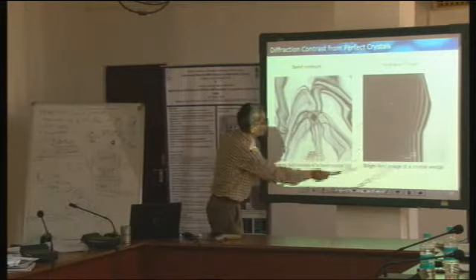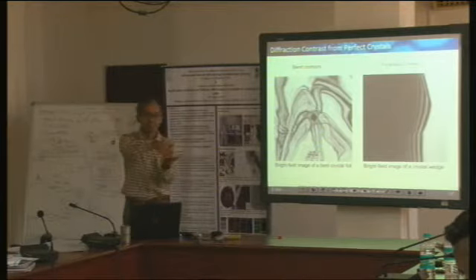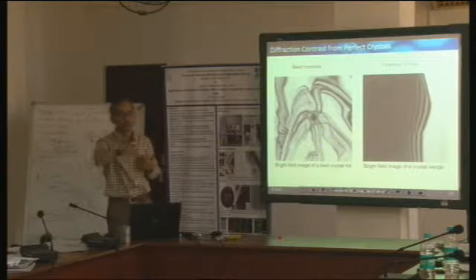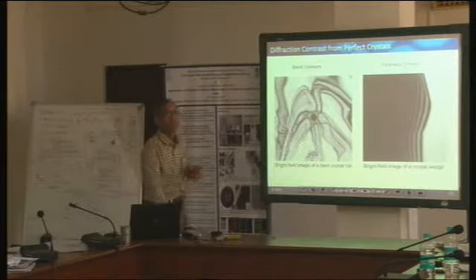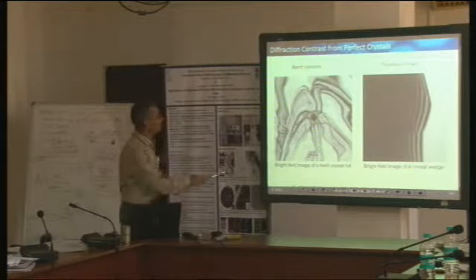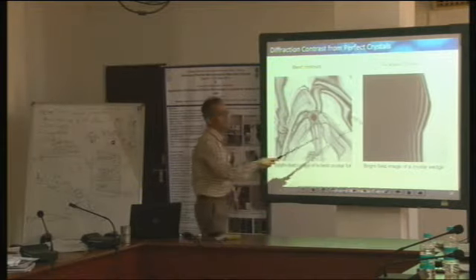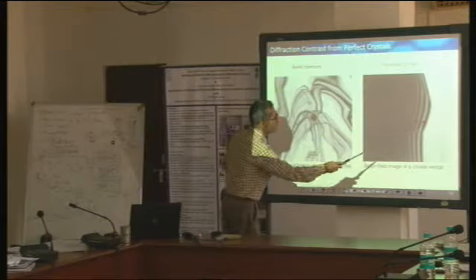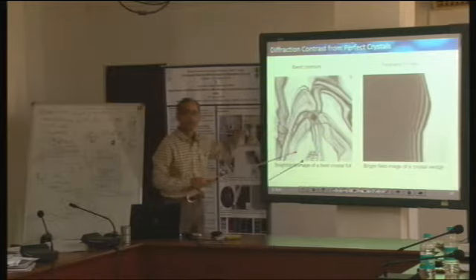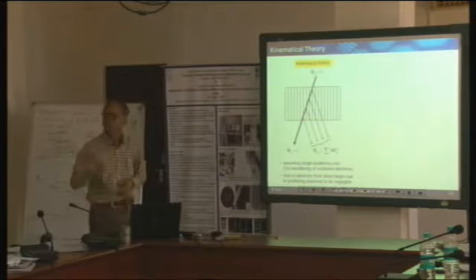Thickness fringes look as if they are regularly arranged, because the thickness, as I told, will more or less regularly increase as we go away from the hole of the sample, whereas the bending can be very haphazard. You can't say that it will bend this way or that way. That's why this looks very haphazard, whereas here this is the hole, and as we go away from the sample, thickness increases, and then you see that as thickness increases, the fringes are appearing black, white, black, like that. Whereas bending is more random, and therefore the contrast is also random. So this much is, I think, also fairly clear.